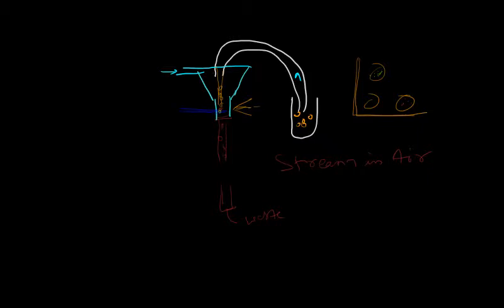Okay, these are fast. Here, as the cells get illuminated, they go into the waste. If I wish to collect the cells separated, so I have two populations and I want to sort them separately, then how can I get it?